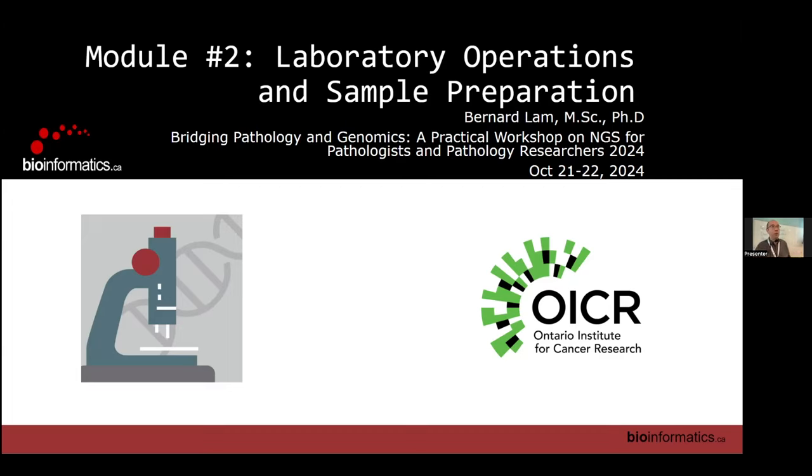So what I will try to do is my best to describe some of the process, what we actually do at the bench level, and give you an idea of what our workflow looks like. I also want to help link it to you, because we are all tied together in that big workflow. The patient samples for next-gen sequencing come from literally every one of you here, and how we can link that together so that we do our best to help our patients is the major take-home message I want to get across in this talk.